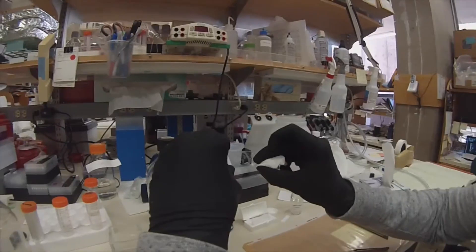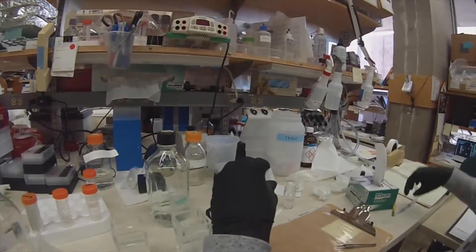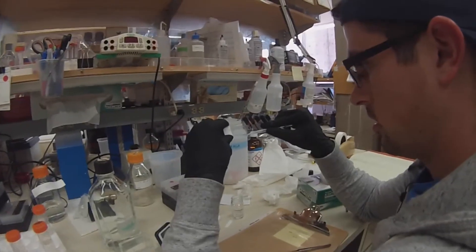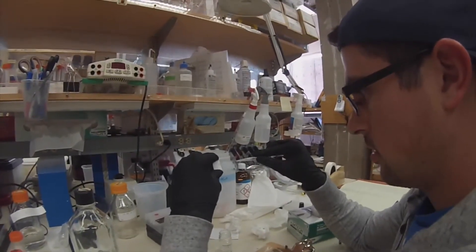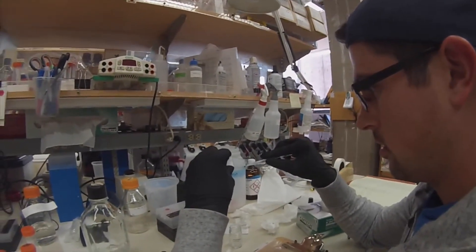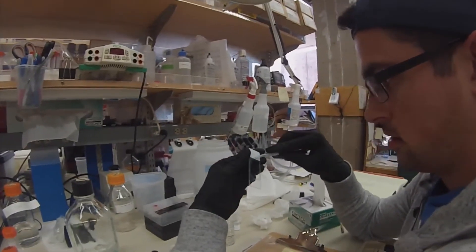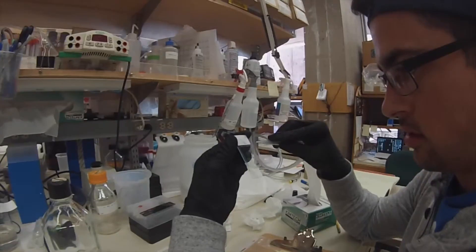From there, what you're going to do is take a small vacuum and suction all the water off the front. Be careful not to go too close to the sections because you can kind of deform the tissue.